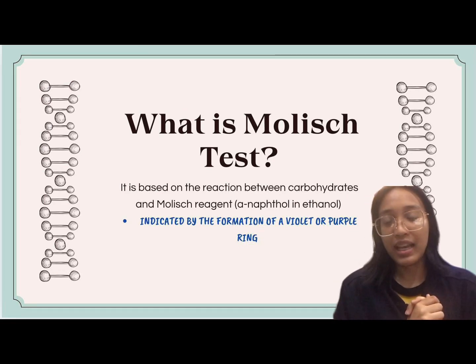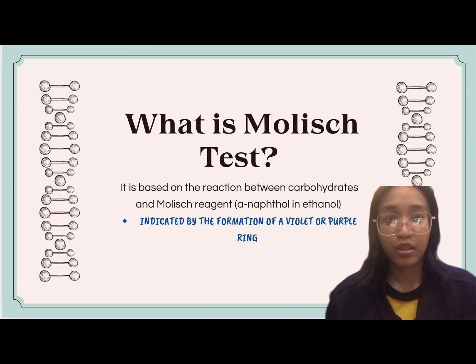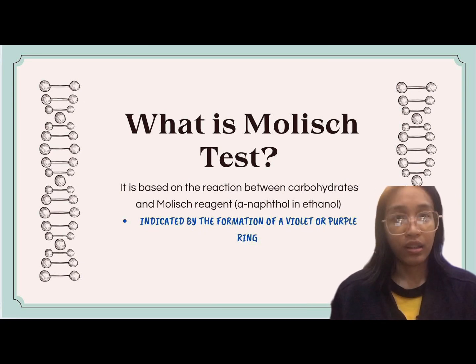What is Molisch test? It is based on the reaction between carbohydrates and Molisch reagent, alpha-naphthol in ethanol, indicated by the formation of a violet-purple ring.